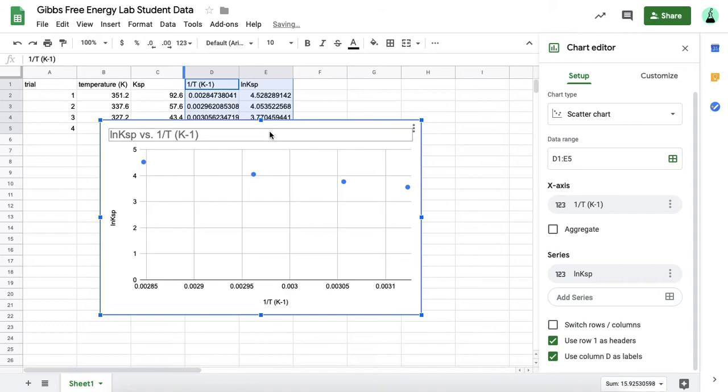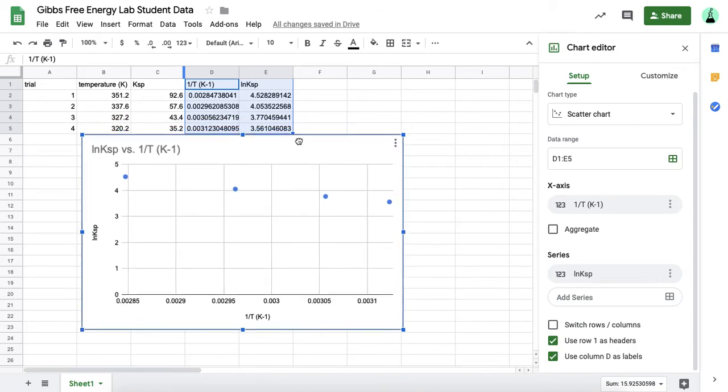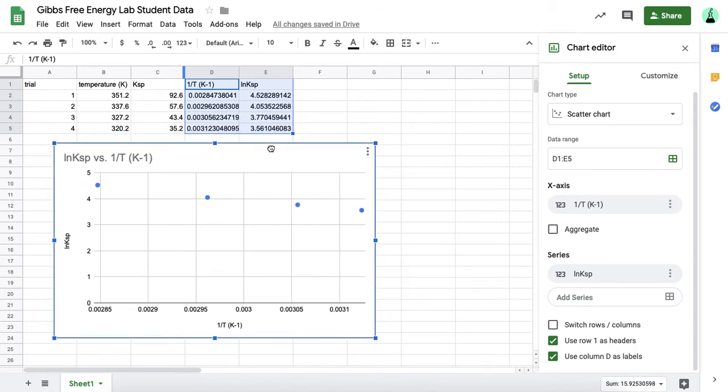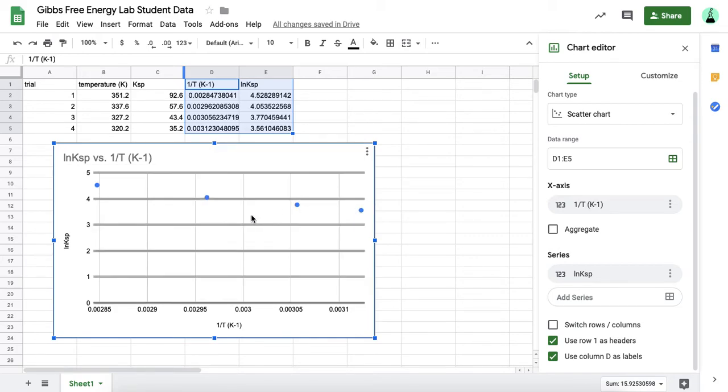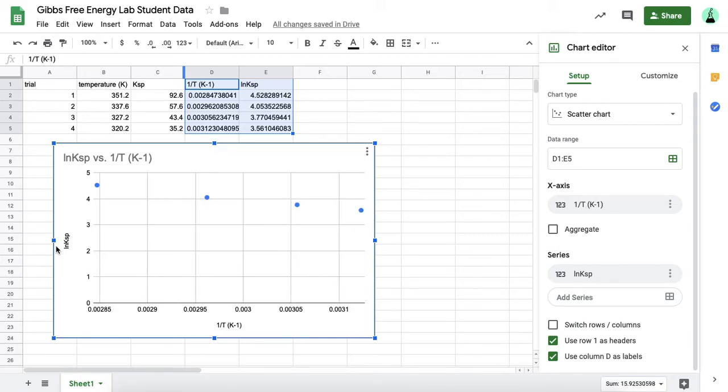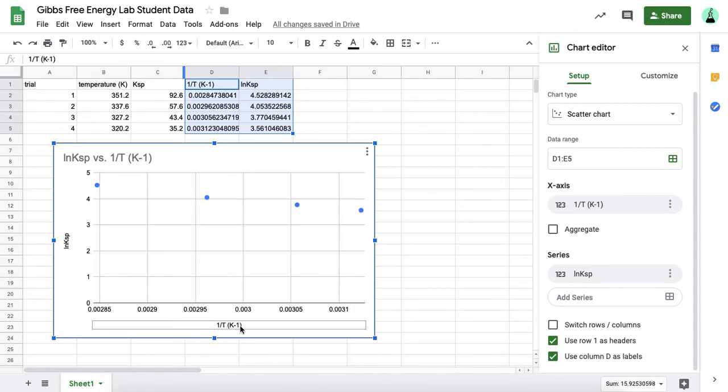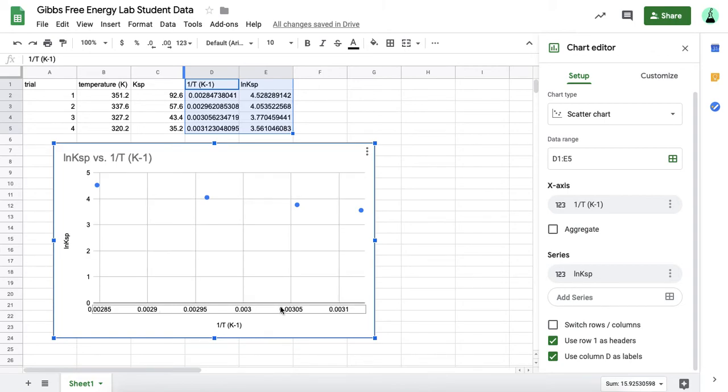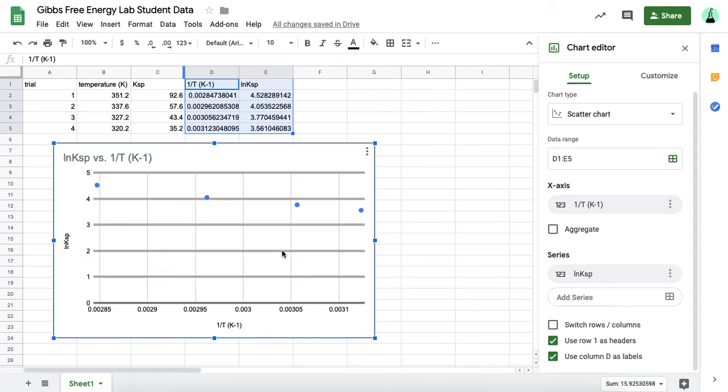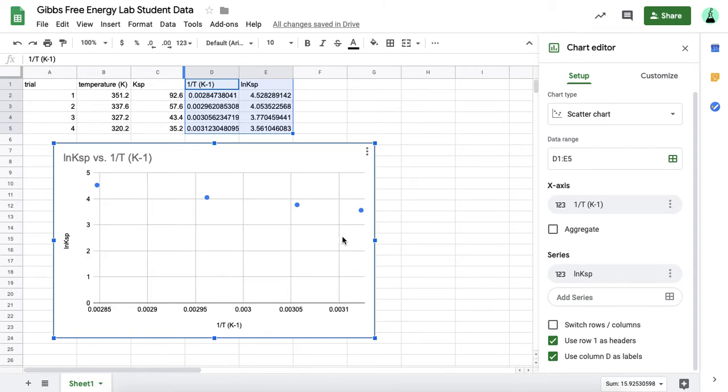Usually it's pretty good at figuring out what kind of chart you need. Here we have a scatter plot, and you can already see a pretty good relationship with our data. We have the natural log of the solubility product constant on the y-axis, and the inverse of the temperature in Kelvin on the x-axis. But there's a couple things you want to do to this graph before you turn it in to me.